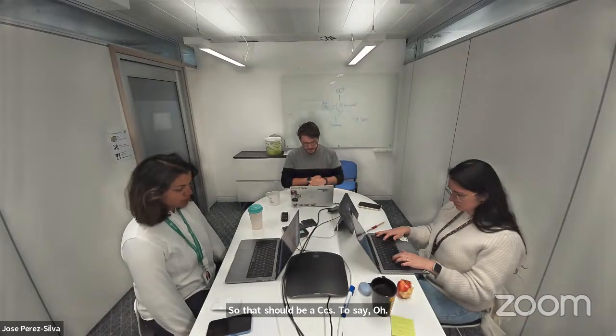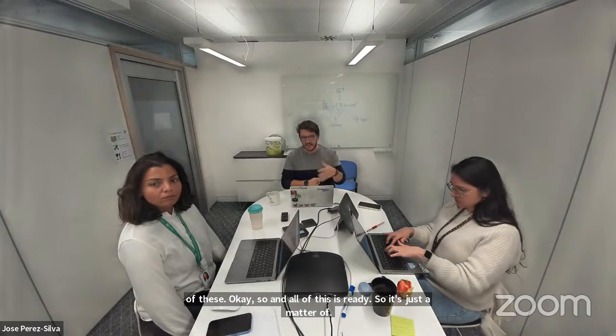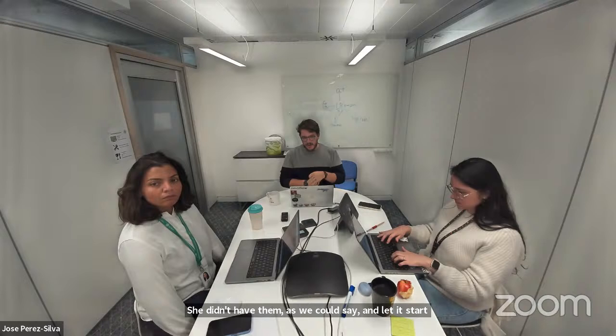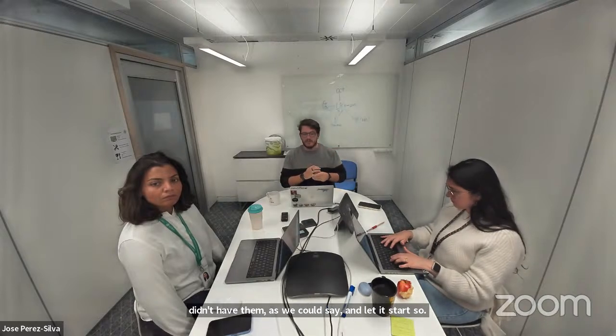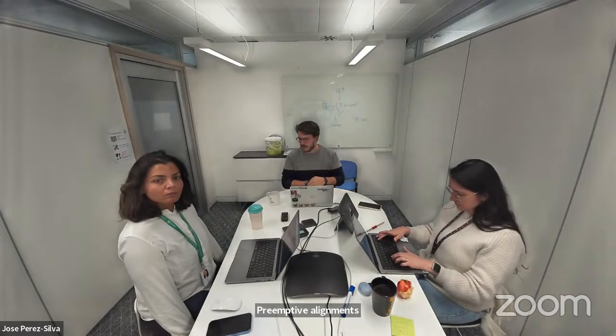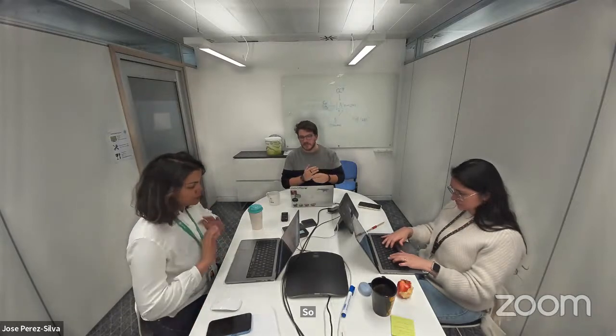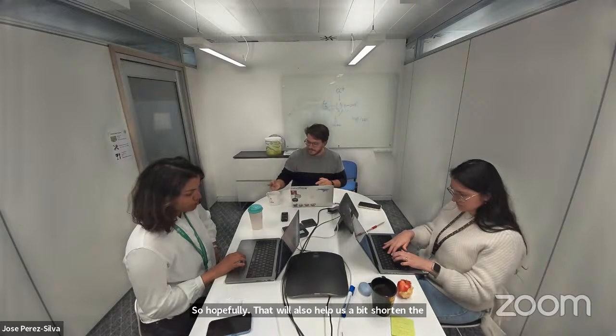What data are we aware of from sheep? All of this is ready, so it's just a matter of hitting a button, as we could say, and letting it start. That huge pipeline, still in development, involves a lot of quality assessment, pre-processing, preemptive alignments, a lot of analysis. So hopefully that will also help us shorten the time that the transcriptomic pipeline often takes.